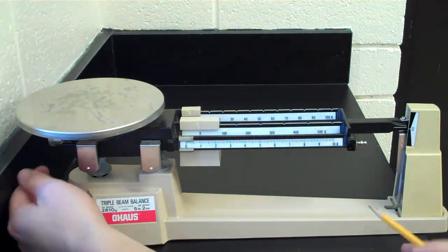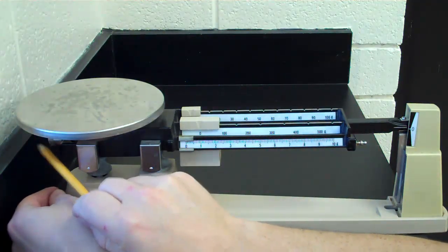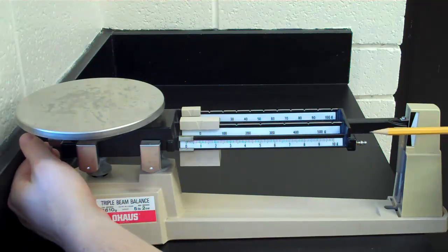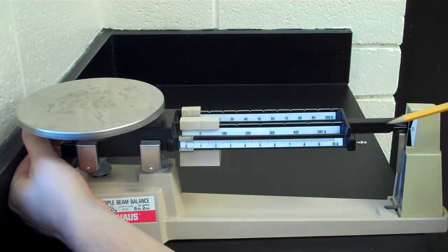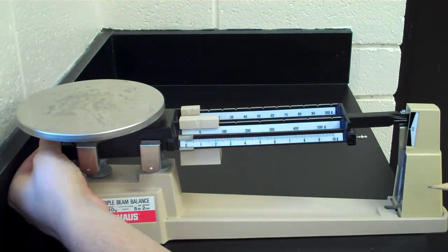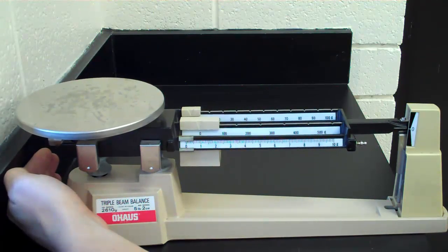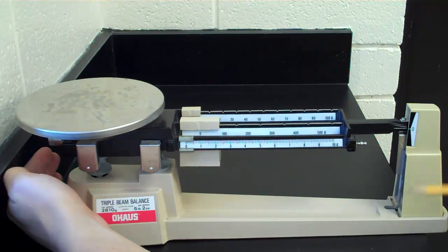This one is not, so we want to use this fine adjustment knob over here. If it's too high, the line on this arm here is too high, we're going to turn that adjustment knob toward us, and that will bring it down a little bit.